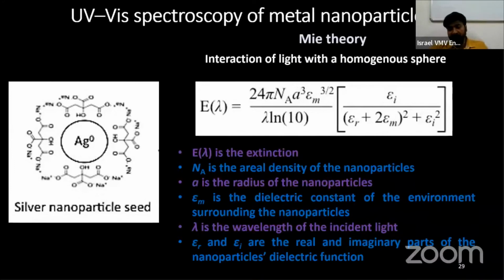It is called the Beer-Lambert law. Absorption is equal to epsilon C L. L refers to the thickness of the absorption medium. L is usually 1 centimeter, the cuvette is 1 centimeter, so usually you substitute 1. So absorption is equal to epsilon C. Epsilon is a constant molar absorption coefficient, you know. So absorption is directly proportional to the concentration.